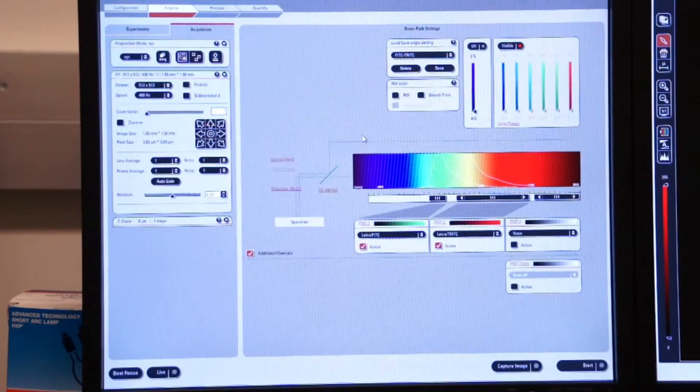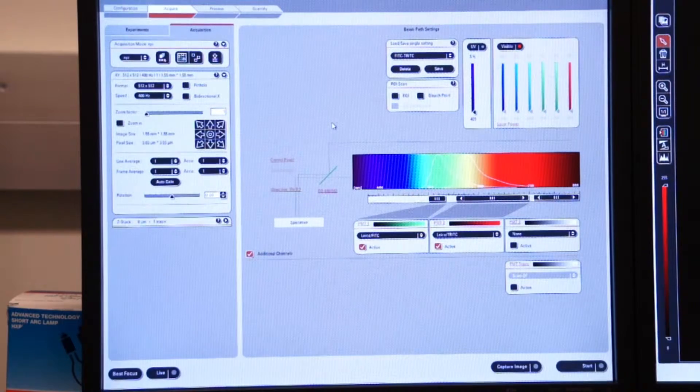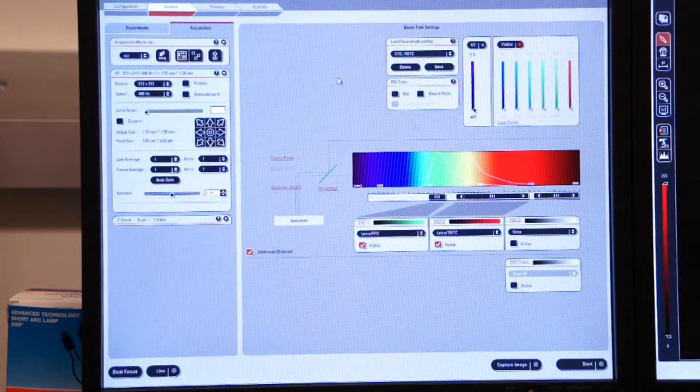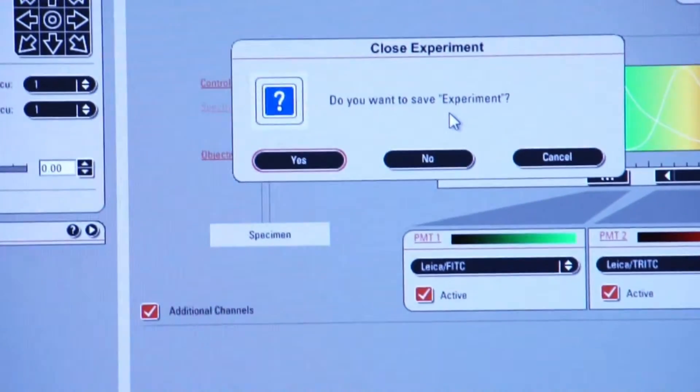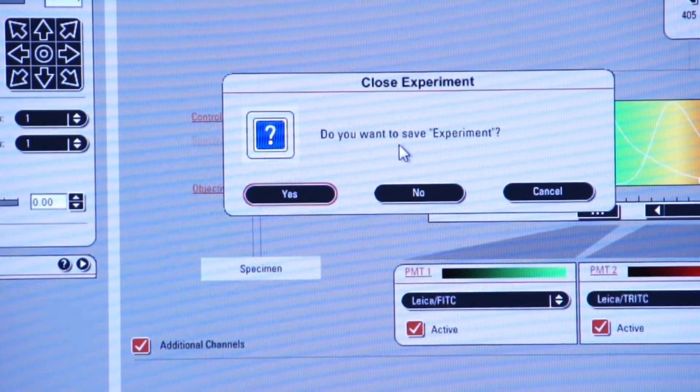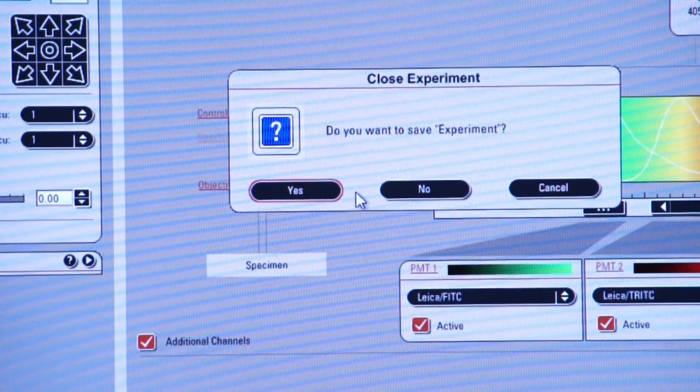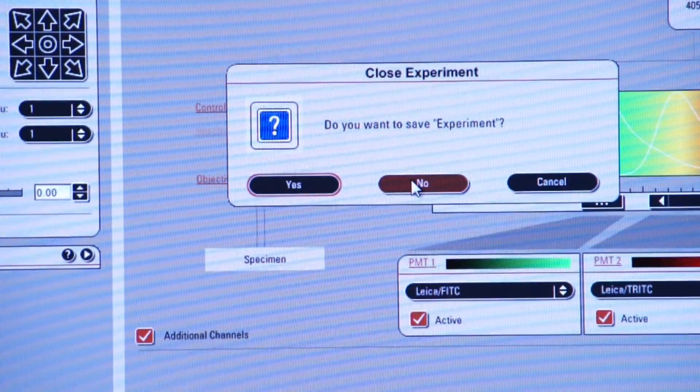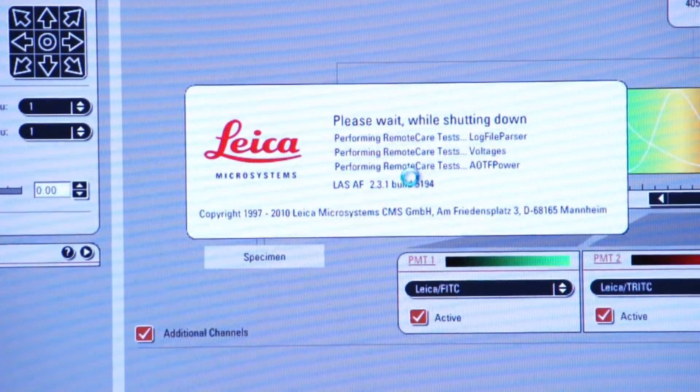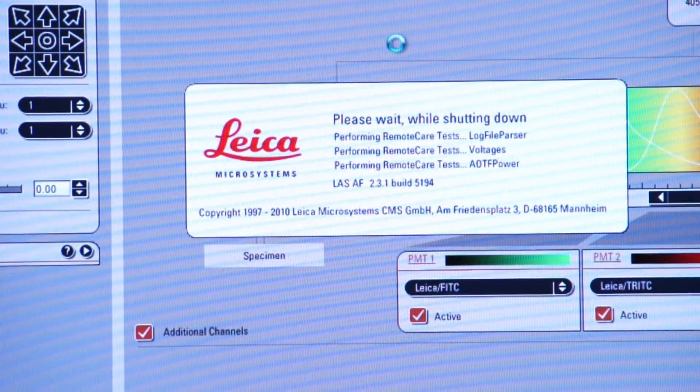Once those are done, we can go back to our acquire tab. Now that the lasers have been powered down, we can exit LASAF by clicking on the red box, and it asks me, do I wish to save my experiment? Since we already saved it, I won't save it again, but this is a last opportunity to save all my images and work before I shut down completely. So I'll say no, and the system automatically shuts down and goes back to Windows.